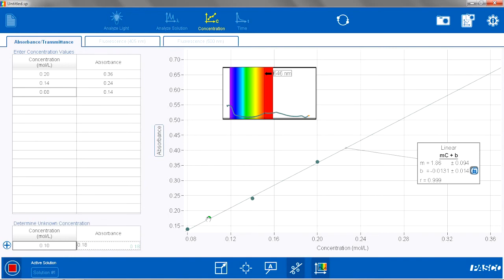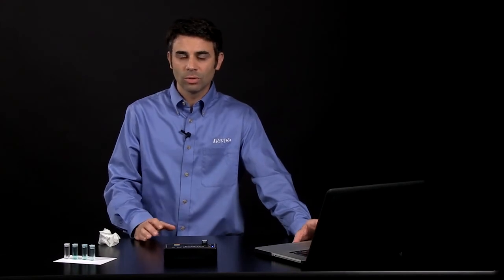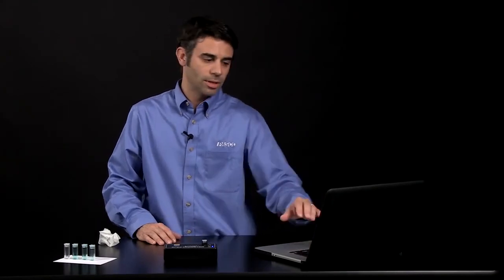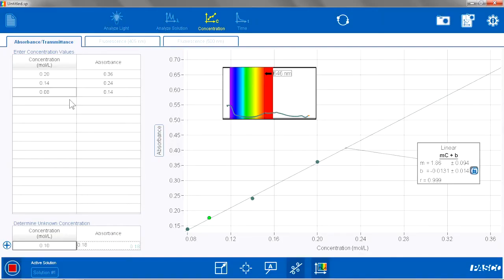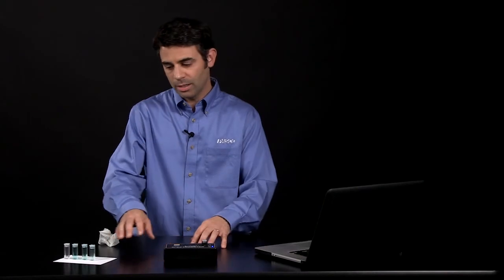Now that calculated concentration of the unknown is plotted on the graph in a color. The color gives the students some clue about how well their predicted or calculated value of the unknown fits with the information they have. Green means everything went well and their concentration fit on the fit line very well. Yellow means they are close but might need to recalculate. Red means they are very far off and are sort of just guessing. Pedagogically, it allows them to create the curve based on the standards, analyze an unknown, and there has to be some work on the student's part to figure out the concentration — and they get feedback from the software.